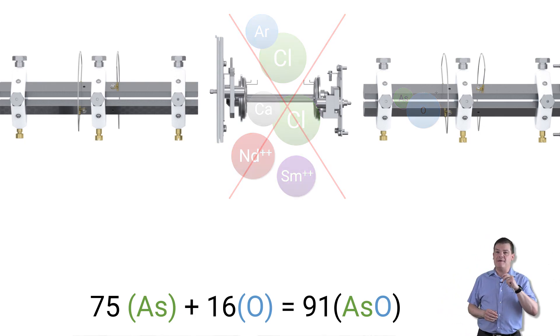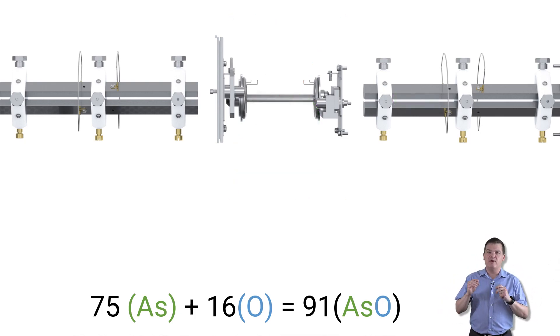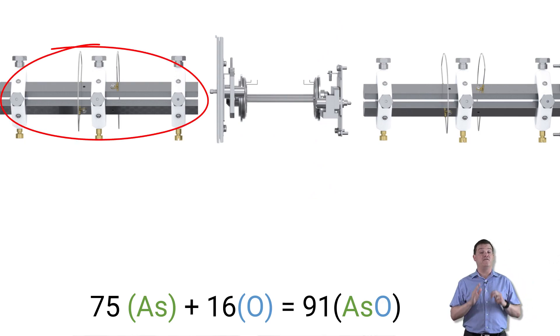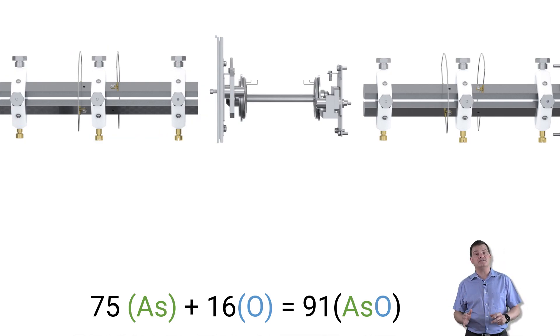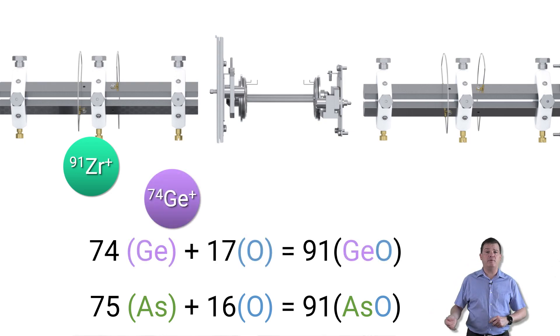The method only works with MSMS though because we need the extra mass filter before the cell to remove any other ions that could overlap with the arsenic product ions such as zirconium at mass 91. And MSMS will also remove any other ions that might react with the oxygen cell gas to form a product ion at mass 91. So for example, germanium 74 plus oxygen 17 would overlap arsenic oxide at mass 91 if we didn't use MSMS.